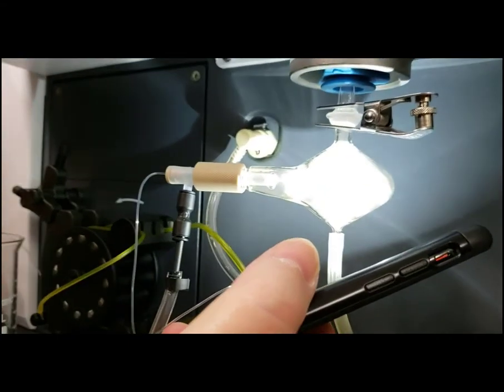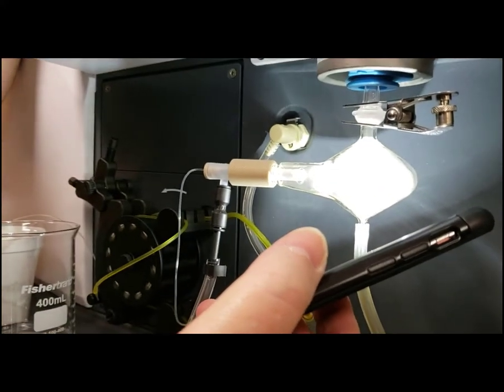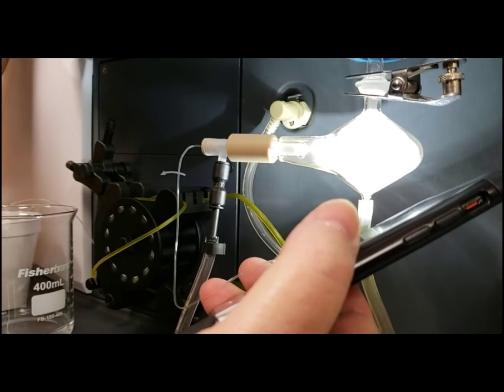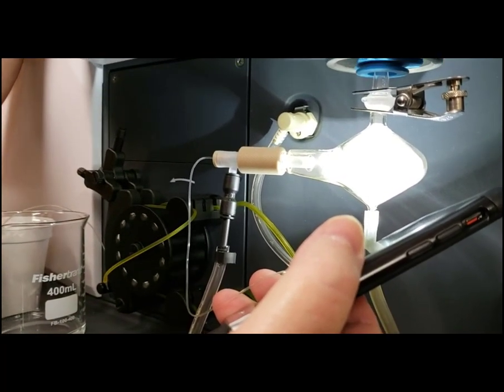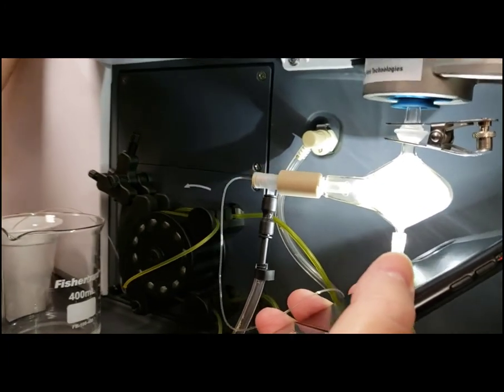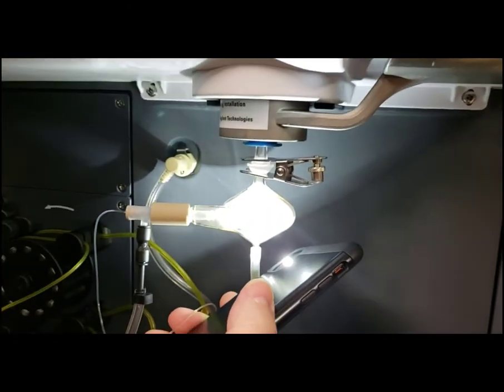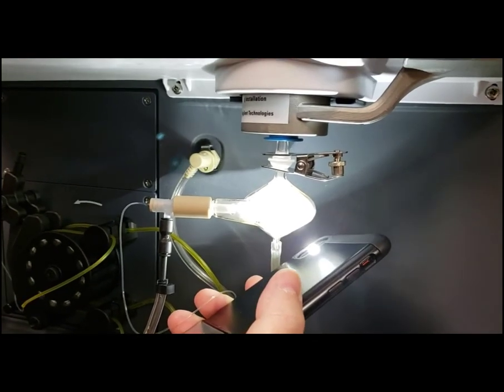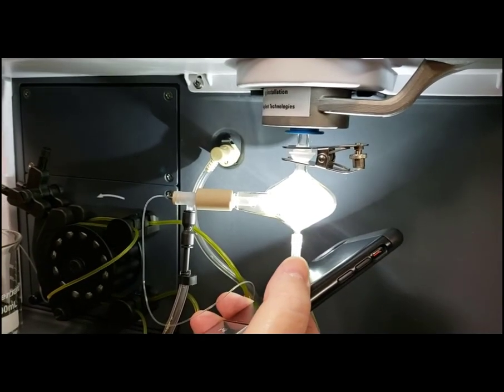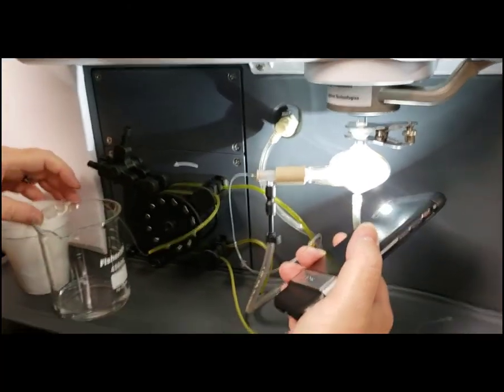But that's what the effect of the Triton X 100 would do. It would be the same thing. You would put that in the rinse, and it will break those bubbles up to droplets, because it's the wetting agent that is breaking that down. It's also the quality of your water. Once you get to good, great water, this doesn't happen as much. Must be a surface tension thing then? Yeah, it is. And charge effects.